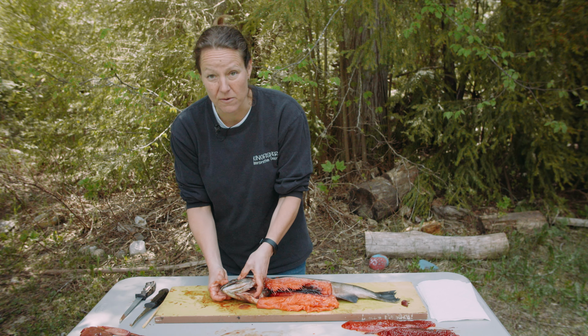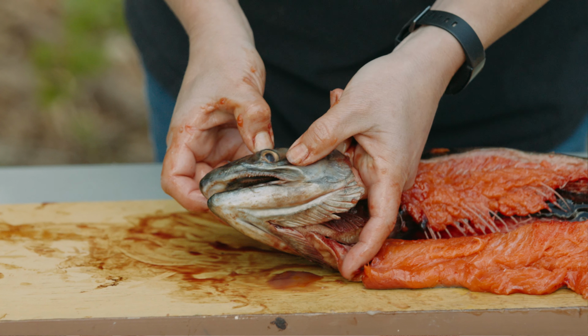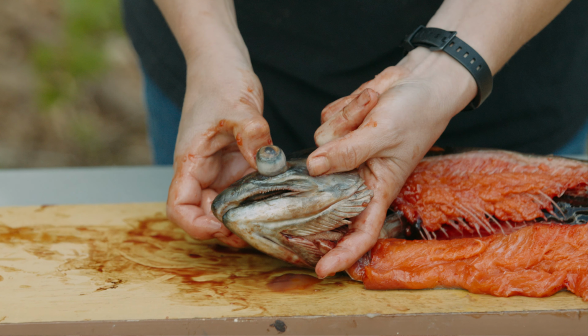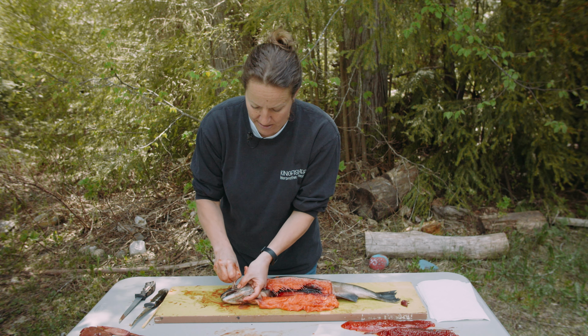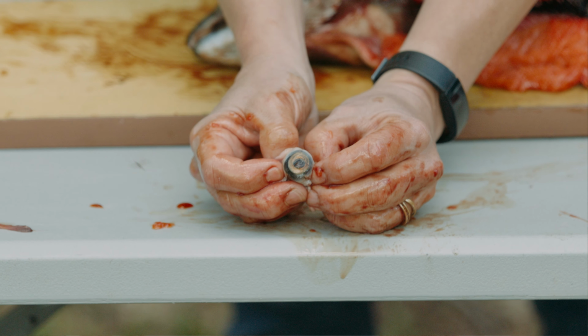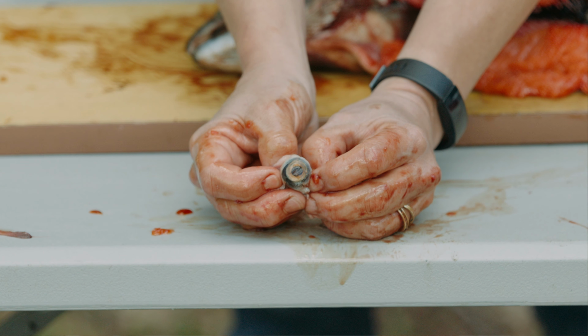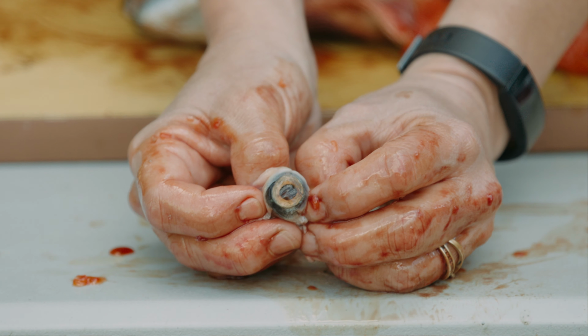I've got to get in behind it, and we're going to pop the eyeball out so that you can see how big it is. So I bet it's a lot bigger than you're expecting. So here it comes, and there it is. So what do you think of that? Pretty neat, hey? So there's our fish's eyeball. And we're going to go even deeper into this eyeball. We're going to try and remove the lens.